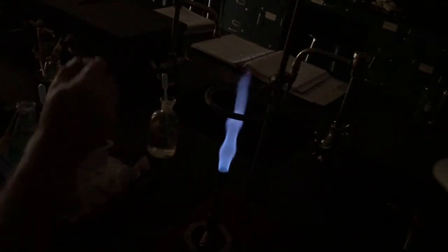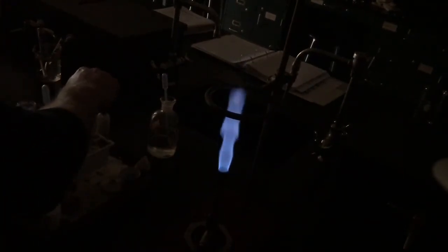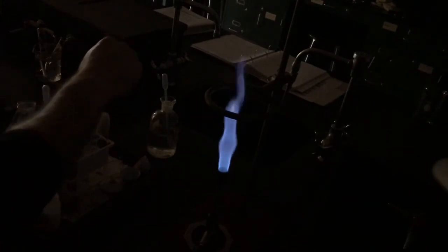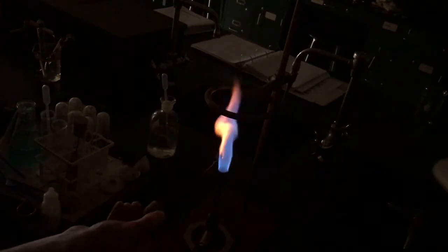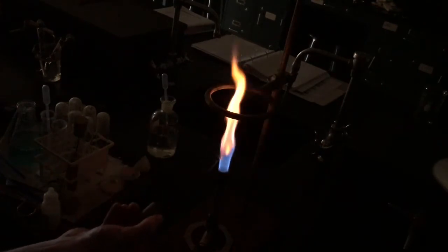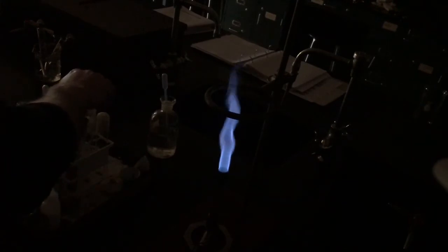Okay, so what we're going to do is take that and put it in some hydrochloric acid and clean it up again. Okay, so this is just burning off. Make sure we burn it off really well.